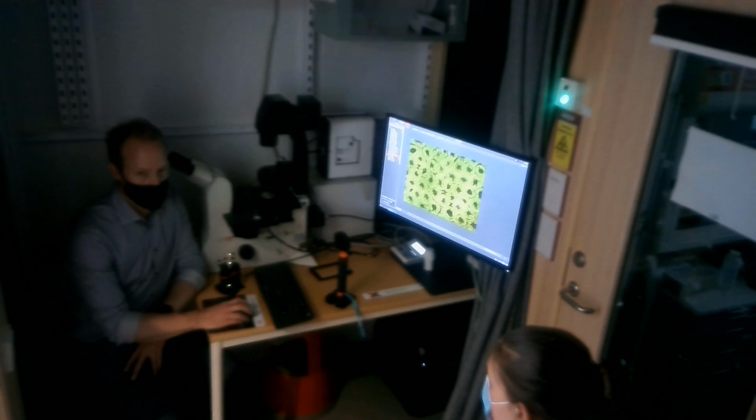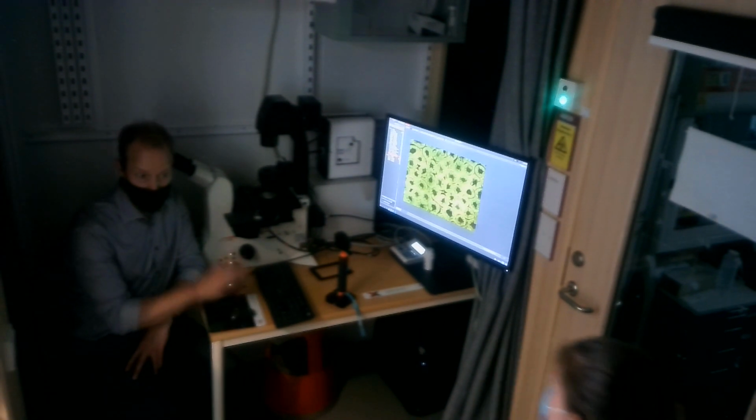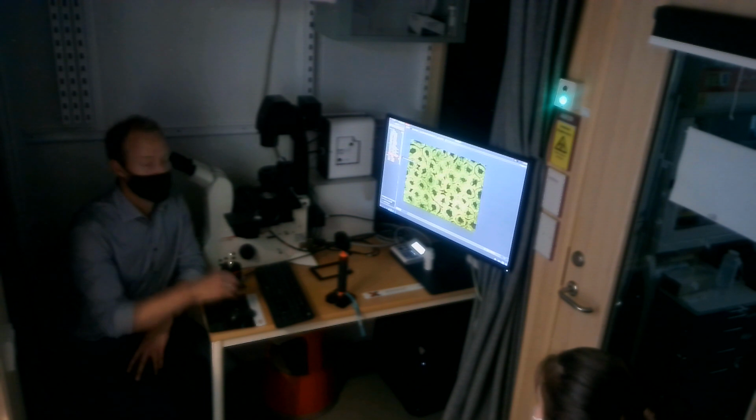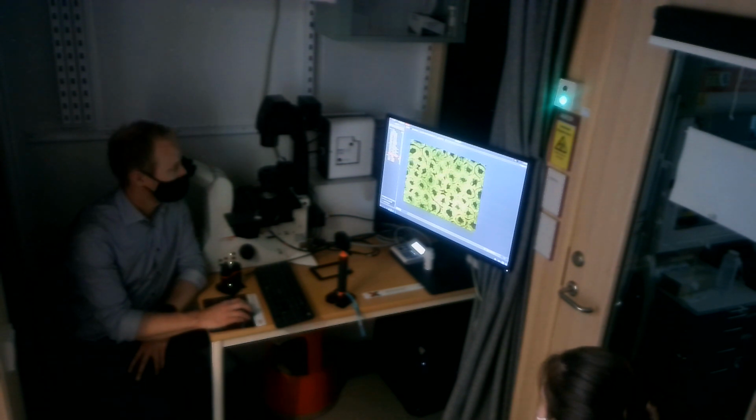Whenever you do a process to an image, if you do a cropping or something in the process tab that we looked at before briefly, it will always create a copy. It will never overwrite what you've done. So you can always merge it afterwards.